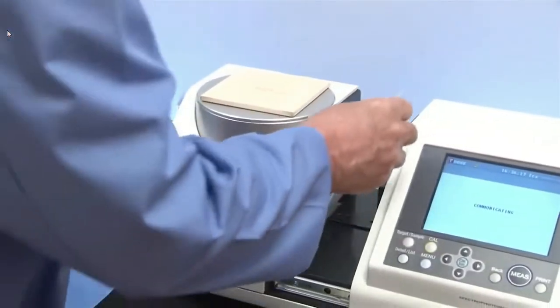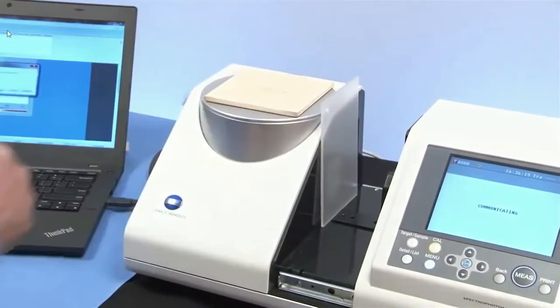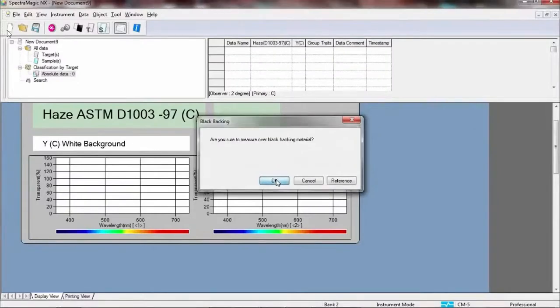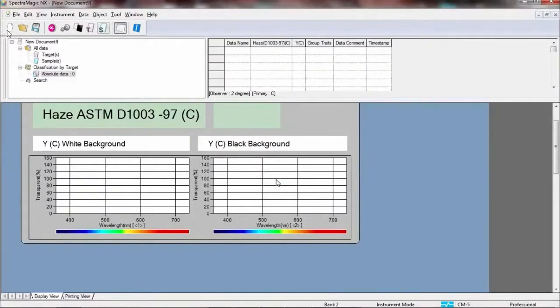SpectraMagic NX allows for measurements of haze with the use of a custom template, an important quality control procedure for many industries.